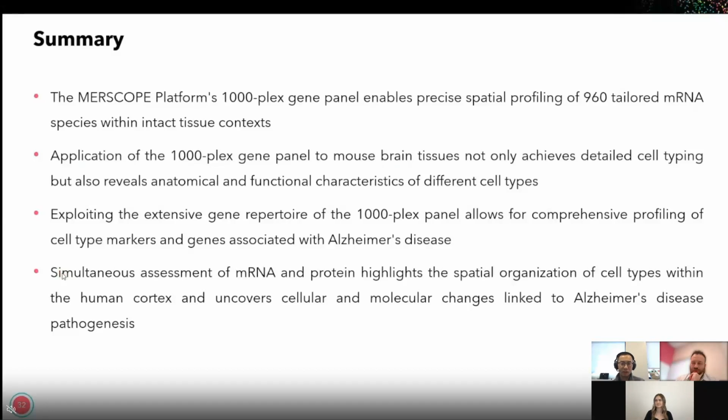Another way to think about this is, after you did clustering, if you think there are some spatial features varied within this cluster, you can even go back, for example, to further divide this whole cluster according to the spatial information, and then further identify the molecular differences in these subgroups. That's really doable. For now, spatial genomics analysis is also actively being developed, so probably more exciting algorithms will be generated to dig into the insight of this comprehensive data.